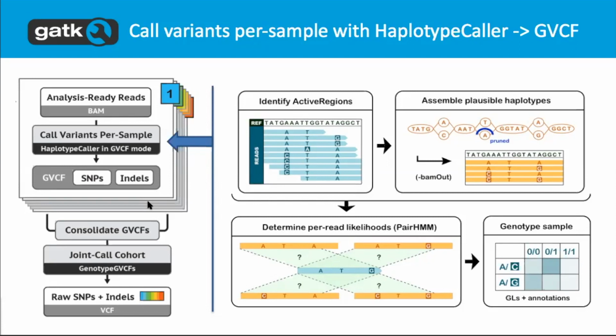And if you have a wide area of the sequence where you only have things like that, you don't want to waste any time making any complicated computations. You're going to want to focus on areas where there is some evidence that there might be something real. It can be a few mismatches.